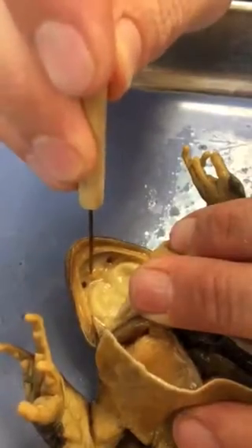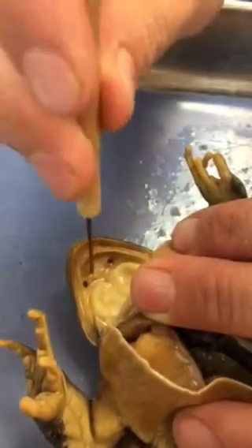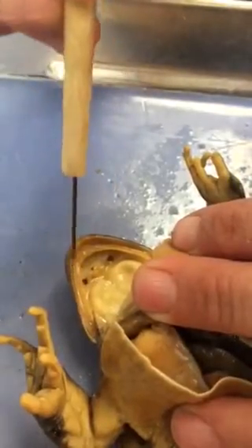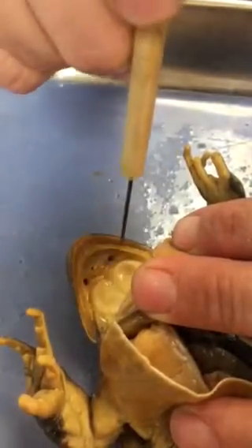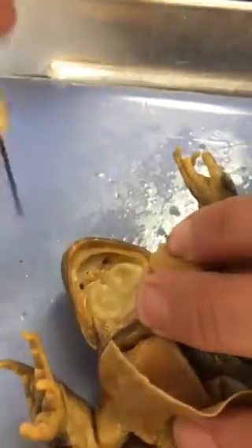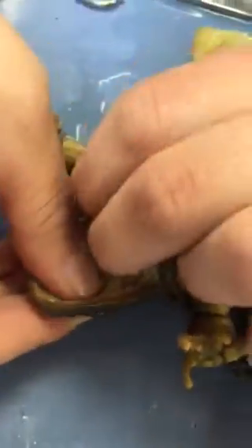So if I have a pin that's just kind of right here, then that's what I'm looking for, the vomerine teeth. These are the maxillary teeth that go along the edge, and the same thing. If I just have a pin that's sitting up here, then I'm looking for the maxillary teeth. Then you go down a little bit further into the mouth.